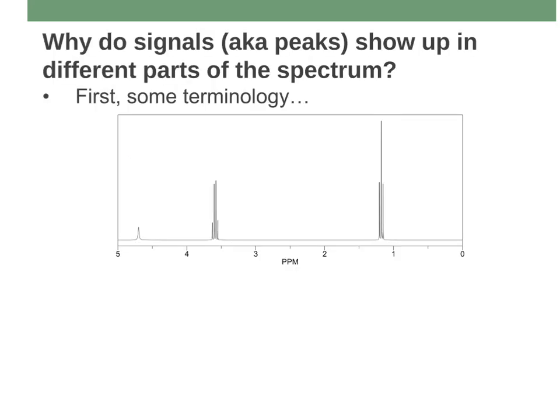that you want to look for when you're looking at an NMR spectrum, and that is the chemical shifts. So what are the chemical shifts? Remember that the chemical shifts are what tell us why this triplet shows up around a little over 1, versus this singlet all the way at like 4.6, 4.7, and this quadruplet is closer to 3.5, 3.6. Why are they in different places?